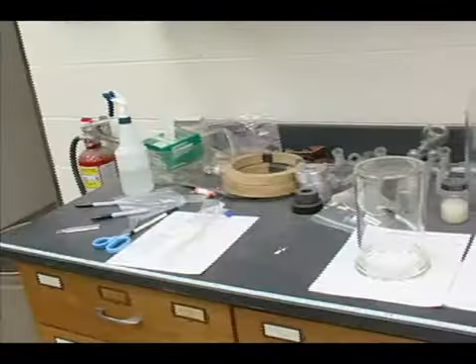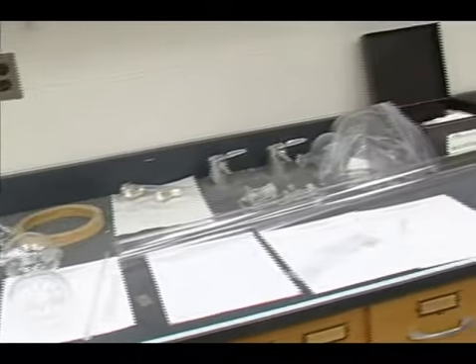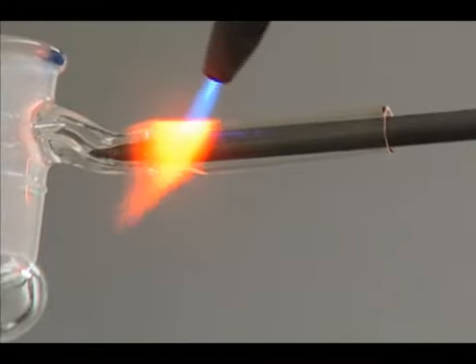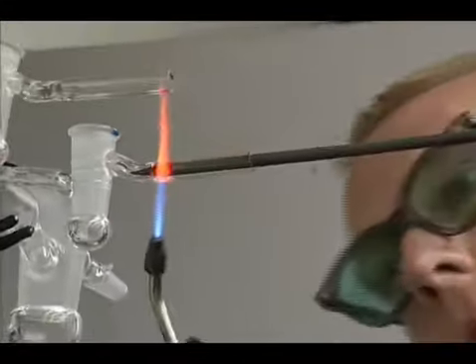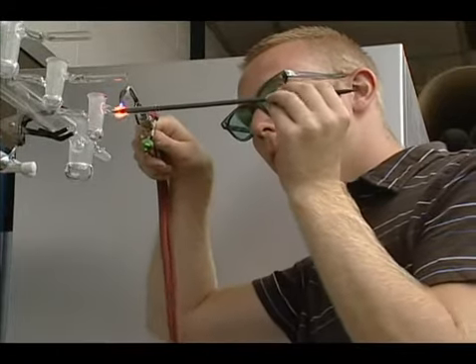Oh, okay. And can you explain the glassblowing process? At MSU, it all starts with an idea. A professor or a graduate student will come to us, sometimes with detailed schematics for what they need us to make. Sometimes they'll have no idea what they need. They'll simply have an idea for what the device needs to accomplish, and then we'll work with them to come up with a diagram. We use a lot of stock glass, various sizes of tubing, or flasks that we just buy in bulk from production shops, that we then modify to make whatever apparatus the researchers need.